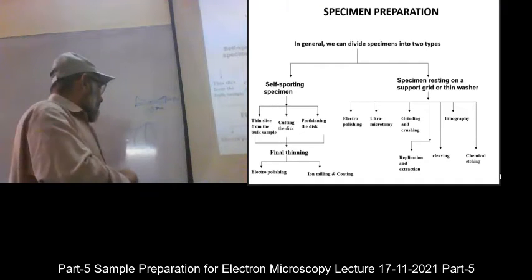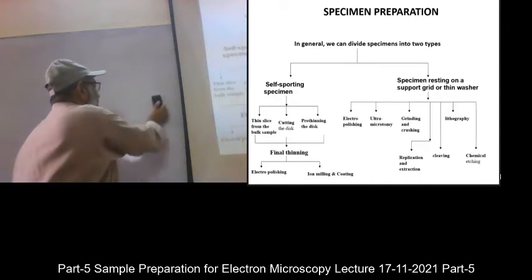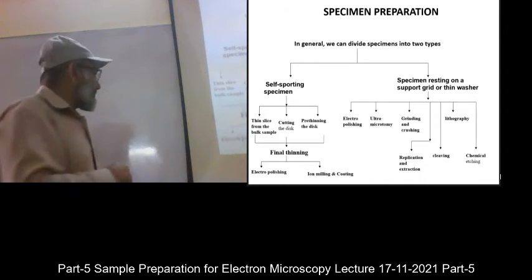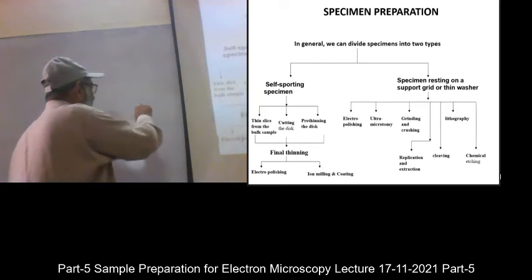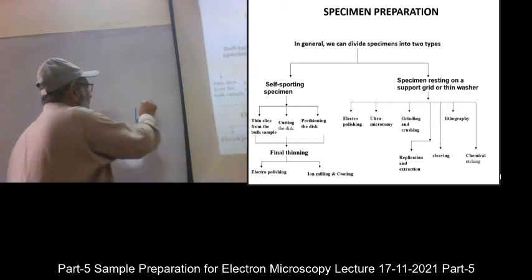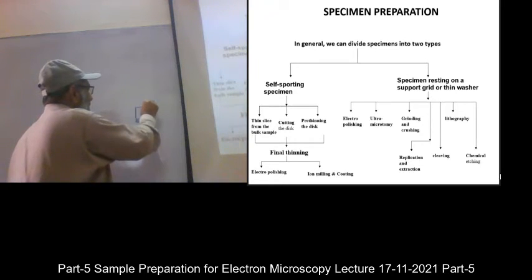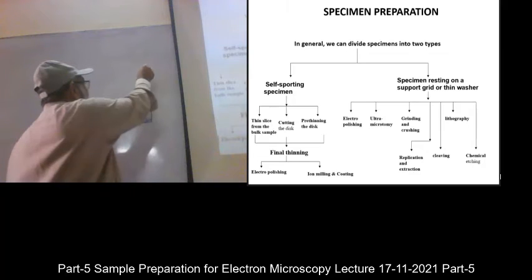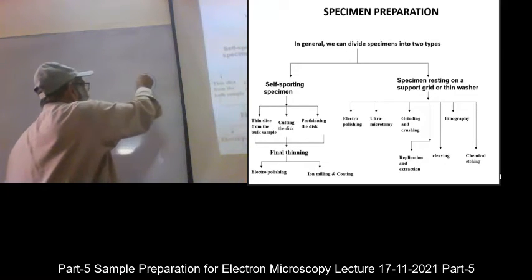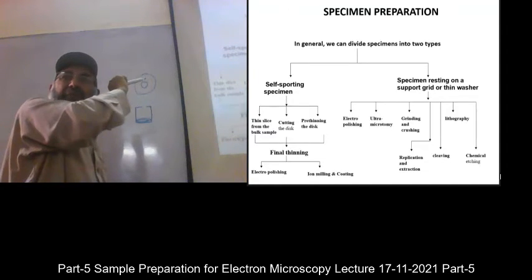After that, you put the sample in the ion beam thinner, and the ion beam thinner is something like this. It is a cylindrical shape. This is with grooves, and here you have something like this, and you put a plate with a 3 millimeter hole in the middle.